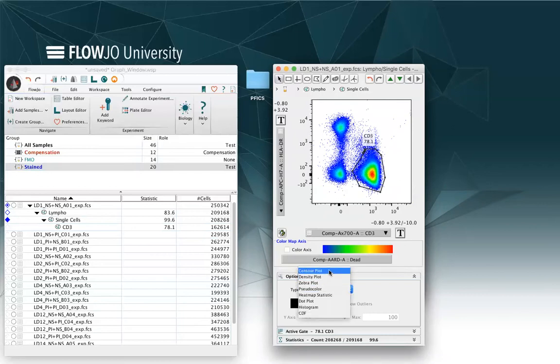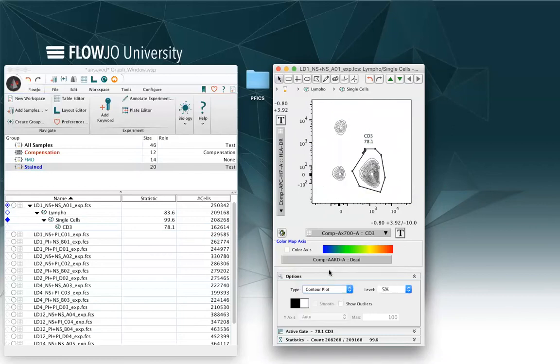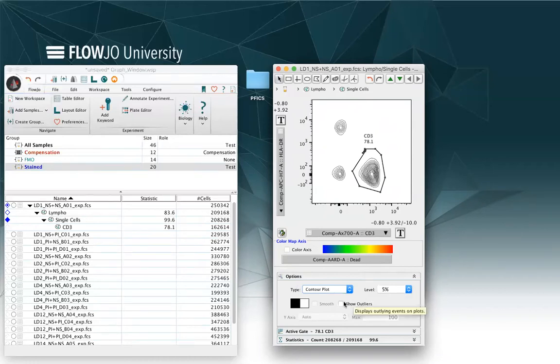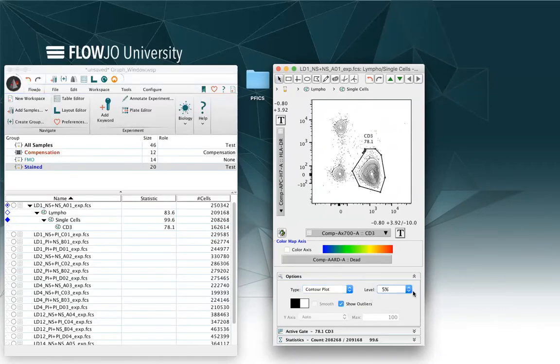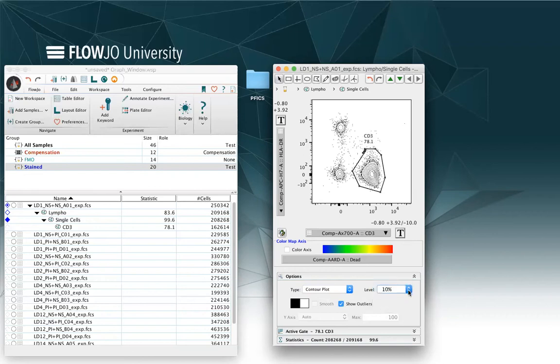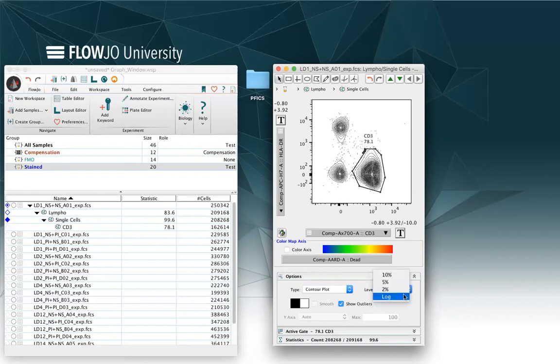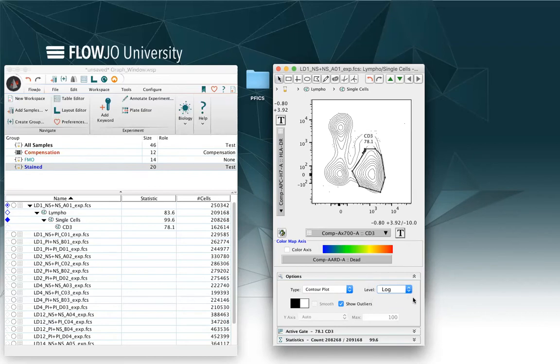Or I can select a contour plot that will draw circles around my population. I can select the level of outliers. I can show outliers.